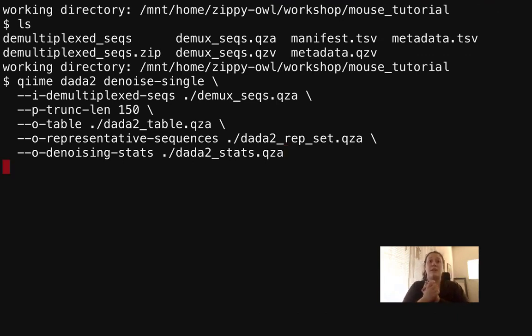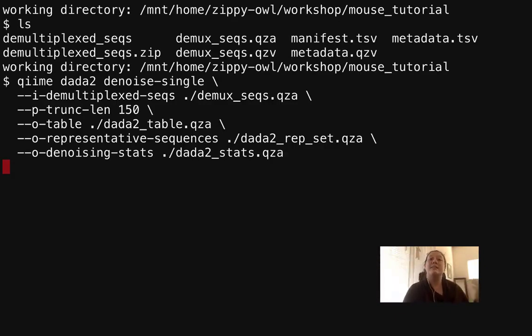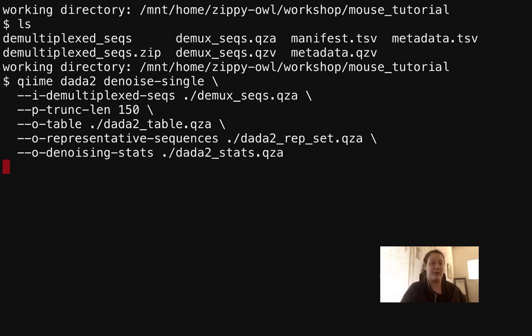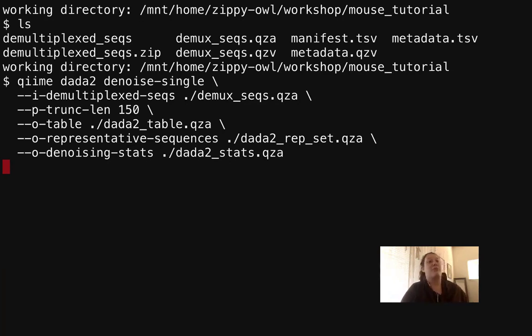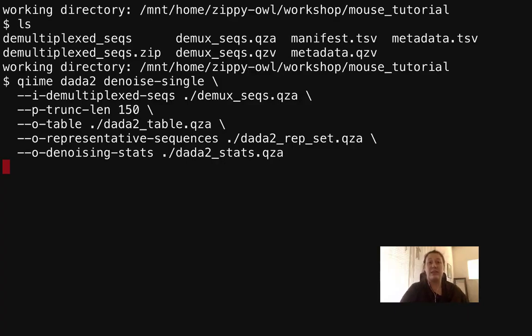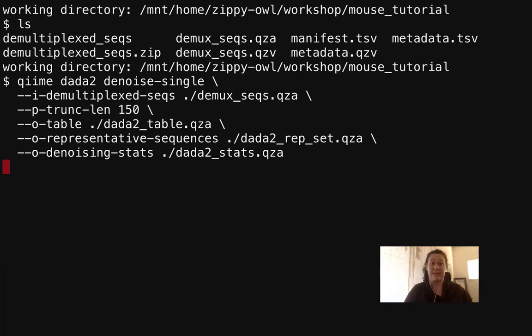First we inputted a demux-seqs.qza file. This is a zip file that contains each read, so when we denoise these reads we'll still know which read belongs to what sample. We didn't use the parameter trim-left, but it is an option for the QIIME DADA2 denoise. What it does is it trims out the primer if the sequence still has the primer in it. But our data is EMP protocol which means that it doesn't have the primer still in it, so we didn't have to trim left.